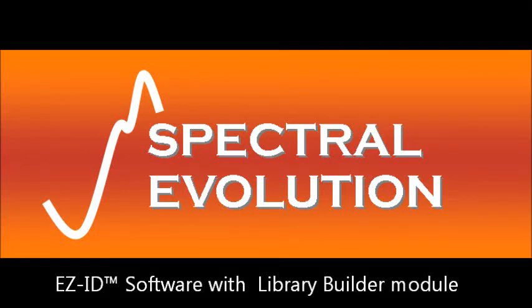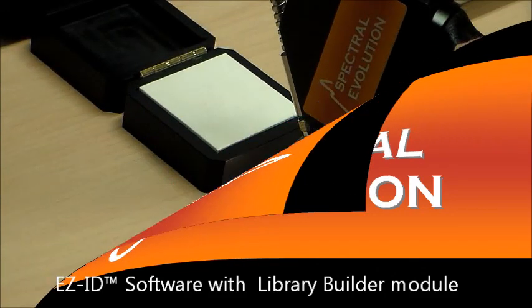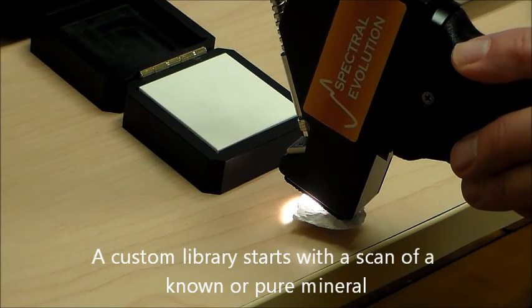EasyID software provides sample identification in real time by matching a spectra from an unknown target sample to a known sample in a spectral library. In this video, we will build a custom mineral library with EasyID's Custom Library Builder Module.